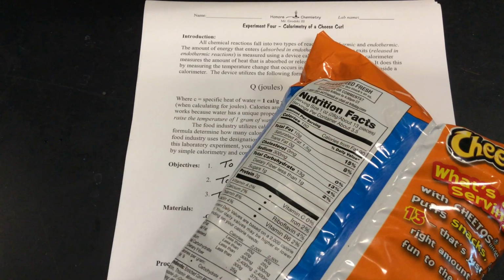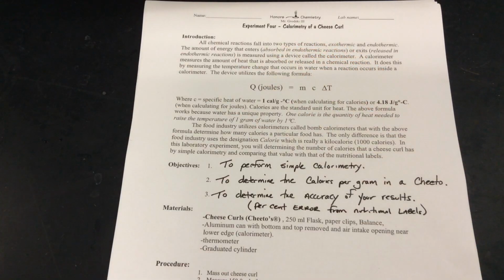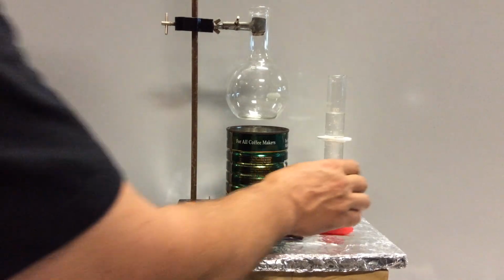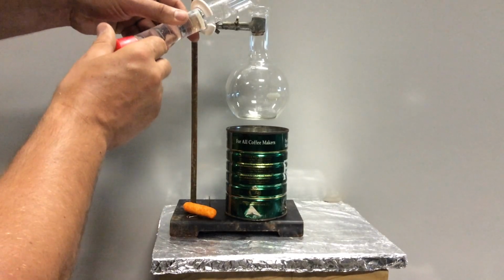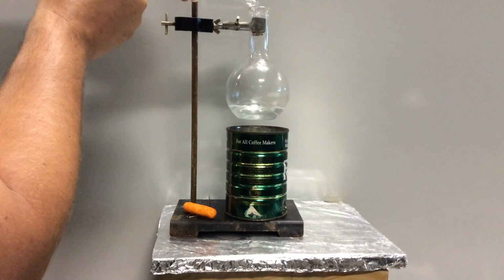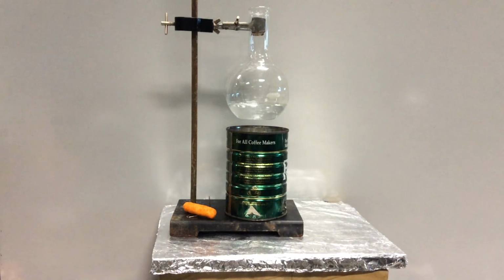So we're going to do those calculations, but we have to come up with energy first. So how are we going to do this? Well, let's talk about the procedure. In this procedure, we're going to start with 100 milliliters of water. We'll put that into this Florence flask, a round bottom flask. Now we know we have exactly 100 milliliters of water.